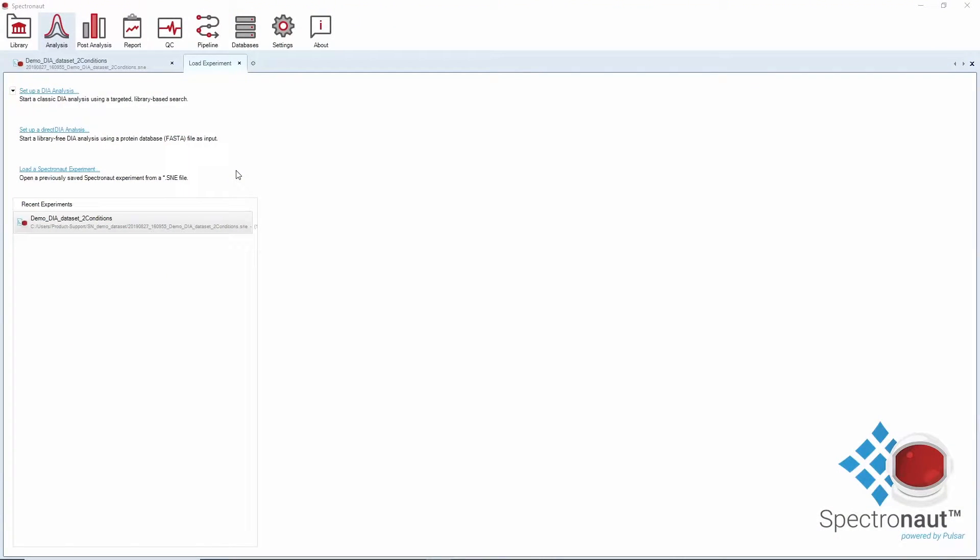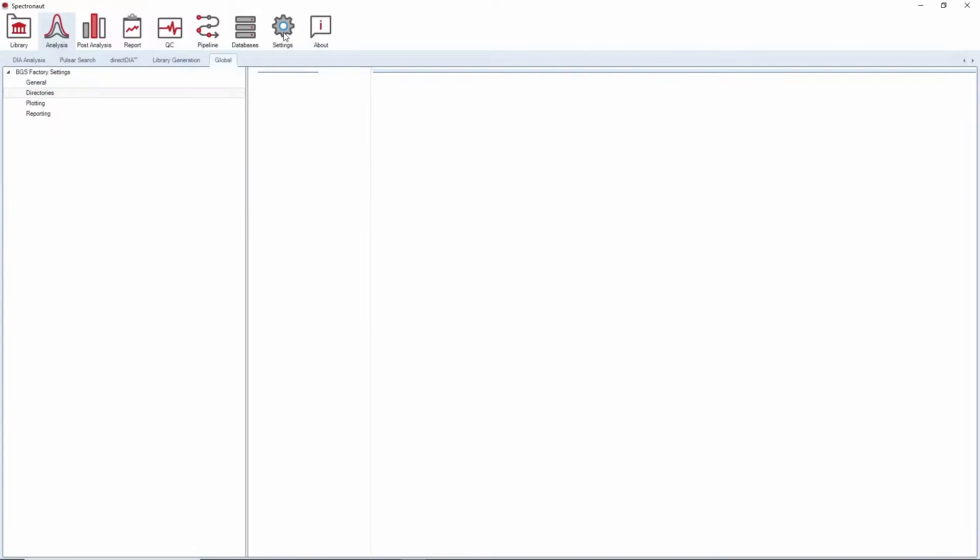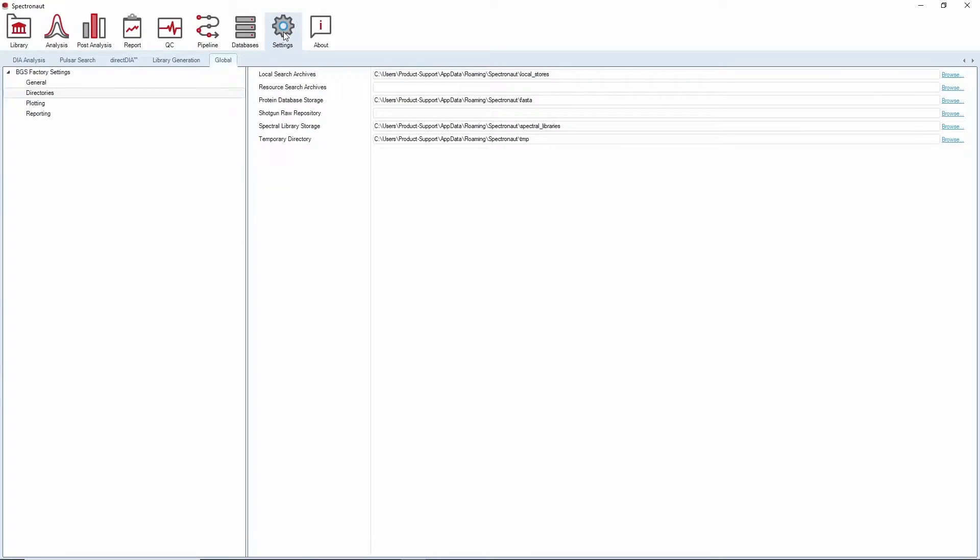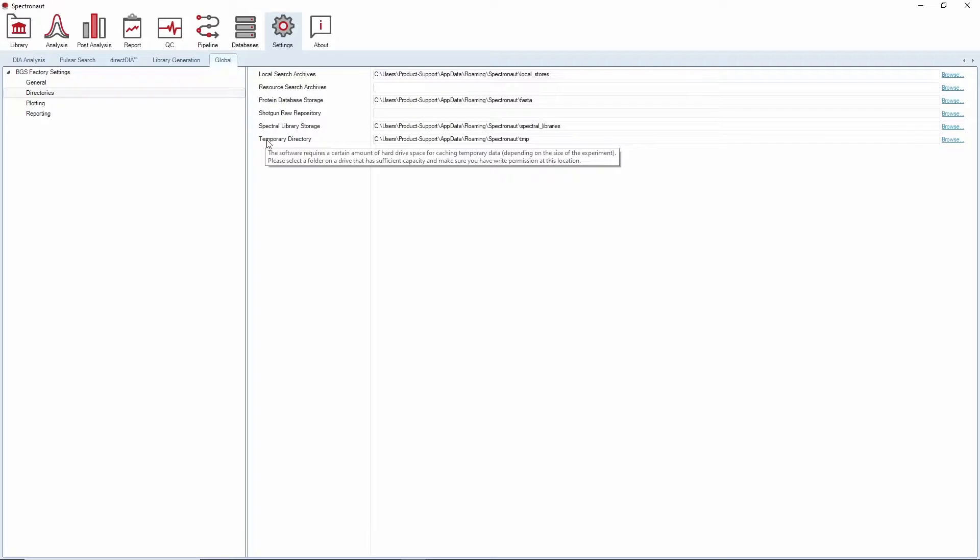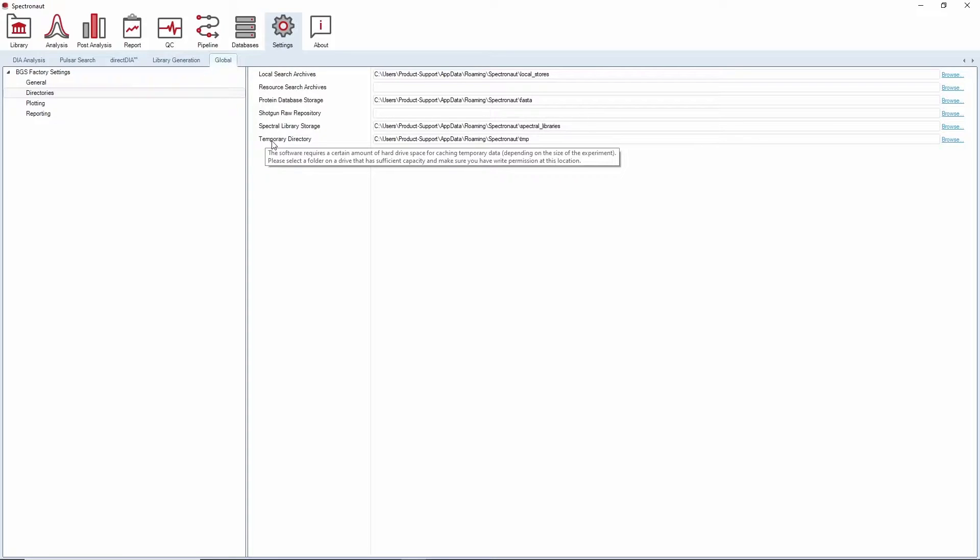As soon as you have successfully installed Spectronaut, we recommend that you go under Global Settings and change the local search archive as well as the temporary directory to local destinations with enough free memory. We strongly recommend running Spectronaut locally, meaning having your run files, search archives and temporary directories on a local drive.